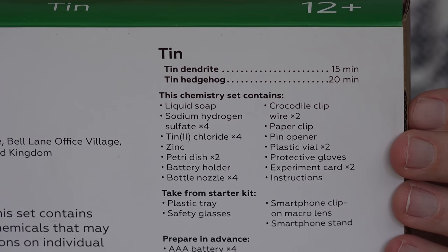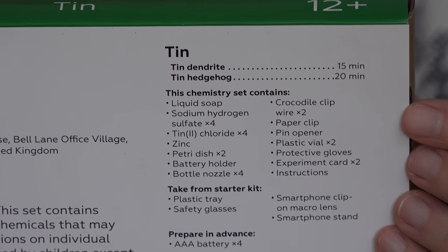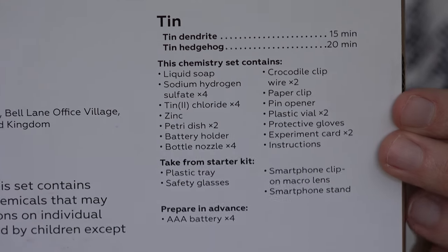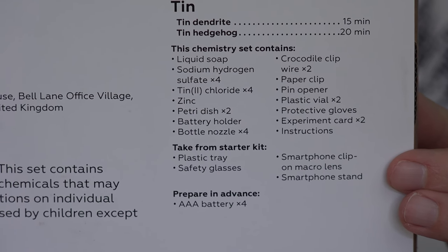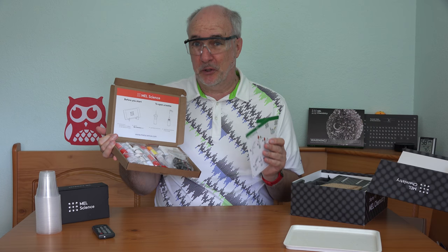The two experiments contained in this box are the tin dendrite and the tin hedgehog. You can see the approximate time it takes to complete each experiment. Here's a list of the supplies and equipment contained in this package, and here's what you'll need to take out of the large main equipment box. I'll also need to provide four batteries. This looks like it's going to be a pretty cool couple of experiments. I think I'll start with the tin dendrite.